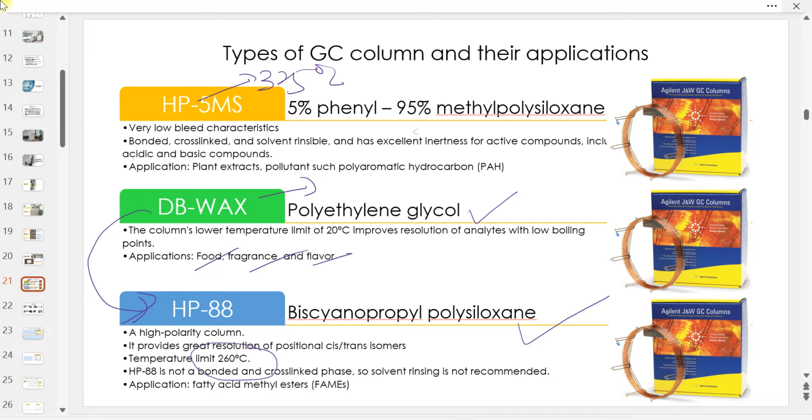application. So this HP88, kita panggil apa? Packing dia dalam kolom is by cyanopropyl polysiloxane juga lah. So still polar lah. Saya rasa tak ada isu sangat yang tu. Yang tu just macam dia punya apa kita panggil ni? Dia punya production something lah. Yang penting ni yang depan ni. Berapa length ni? 30. Okay, so saya recommend buat 30 minit saja boleh dah.